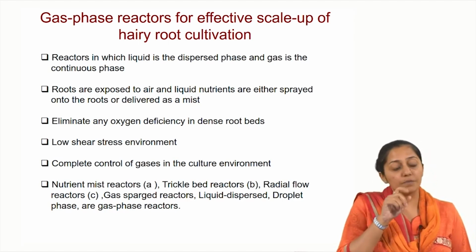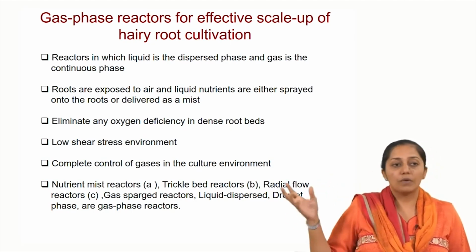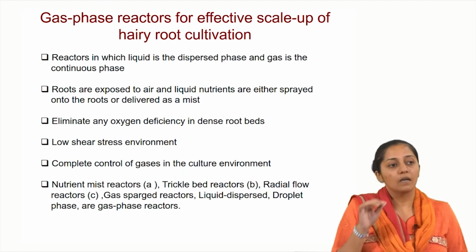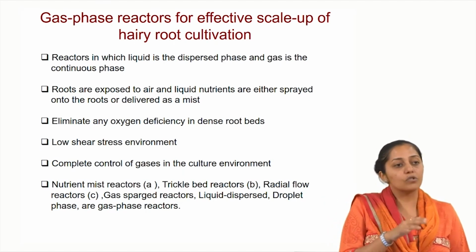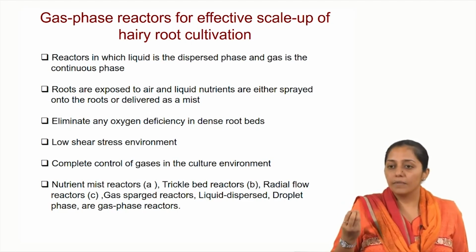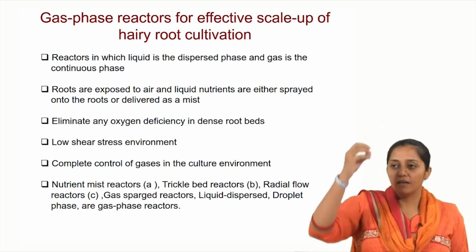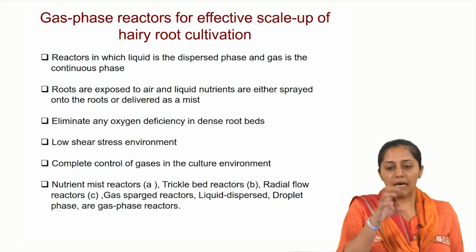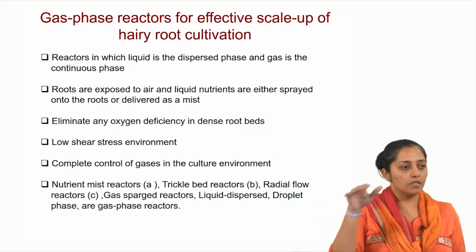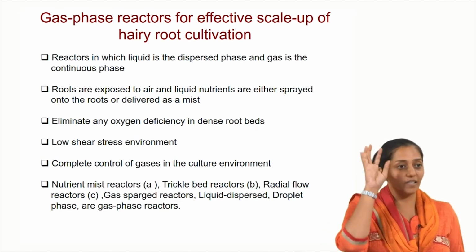Now, coming back to the spray bioreactors, it is not that we were directly doing everything in parallel. One was that we were trying to test the mist design. Before that we had also got custom made small setups where we were using a nozzle, and this nozzle could create a spray of the liquid medium. We first put the roots onto the support, and beneath the support we had that spray, so that it does not directly hit the roots.